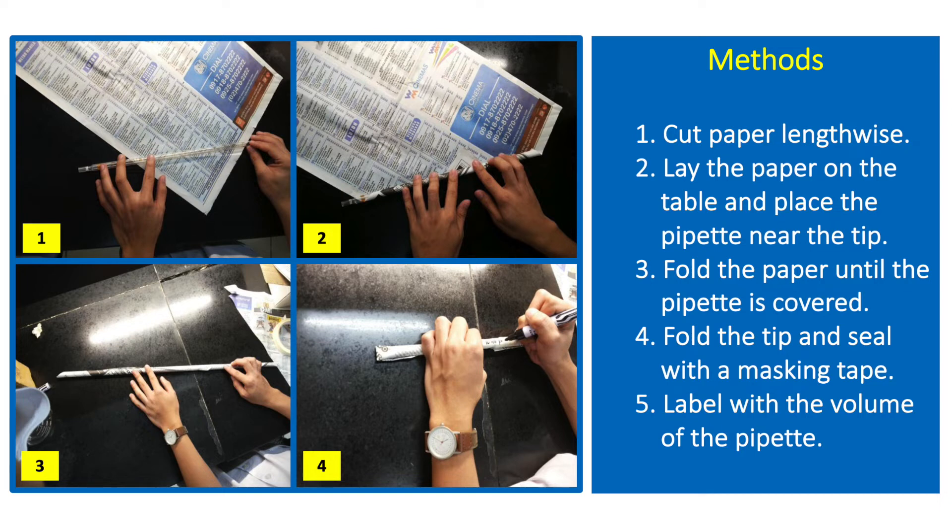Fold the paper until the whole length of the pipette is covered. Fold the tip of the paper, seal with the masking tape, then label the pipette with its volume or capacity.